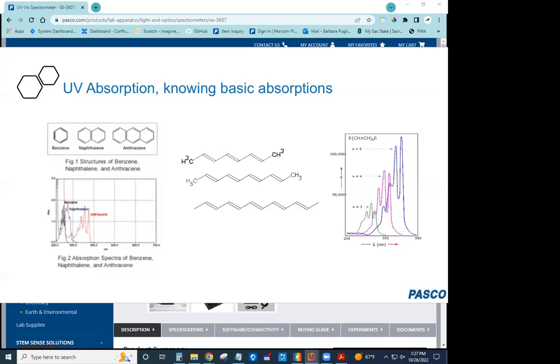That's typical for that kind of molecule that you want to study. Now, is that the only thing that can absorb those? No. But what I wanted to say is that as you get more and more rings, you'll see that spectra slides to the right. And that's what you can use, again, to determine how much of any one of those substances you might have.